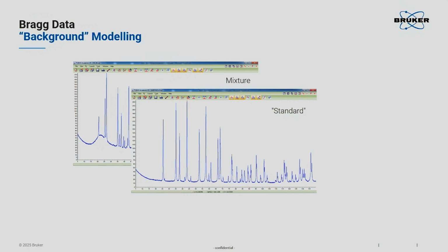And by the way, if we're talking about a perfectly crystalline material, 100% crystallinity, does such a material exist? It has been shown by the guys at NIST that even in what is assumed to be a perfectly crystalline sample, you have the non-diffracting surface layer around each particle, around each crystallite, and reaction products or adsorbates or whatnot in a finely divided material account for 1 to 3% of amorphous material.